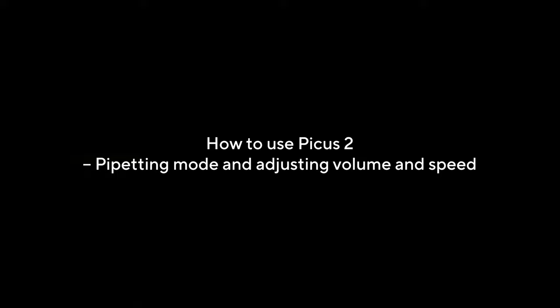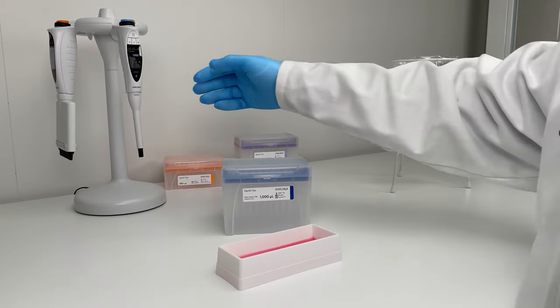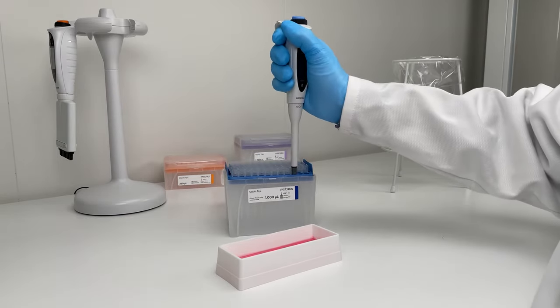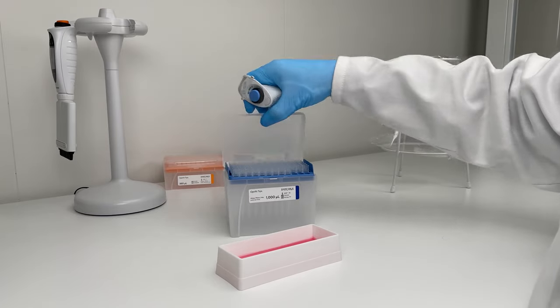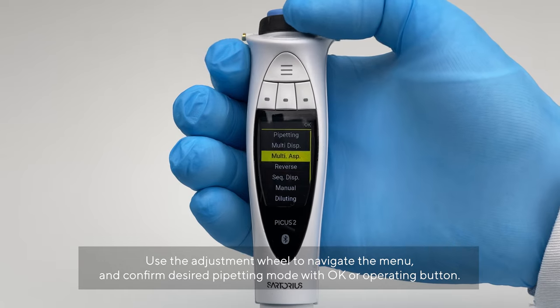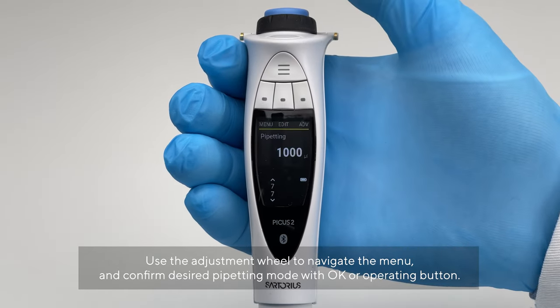How to use PICUS 2: pipetting mode, and adjusting volume and speed. Use the adjustment wheel to navigate the menu and confirm your desired pipetting mode with the OK or operating button.